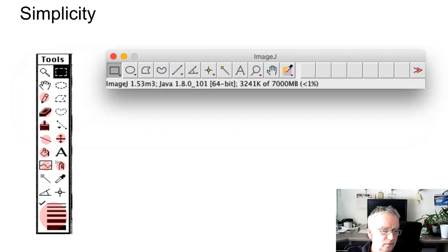Talking about simplicity, I found it interesting that Wayne Rasband tried to make ImageJ even simpler with each version, okay? If you look at the former NIH Image toolbar, and this is the current ImageJ toolbar, there are a lot of icons that have been removed from the toolbar itself. Okay, so the simplicity is achieved by removing stuff or putting them in different places. Of course, for example, the drawing tools were removed from the main toolbar, but they are still available if you need them in the toolsets menu, which is over there. I cannot see it. It's here. Okay.